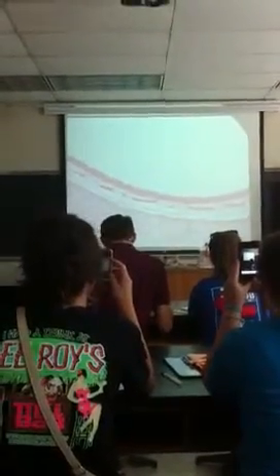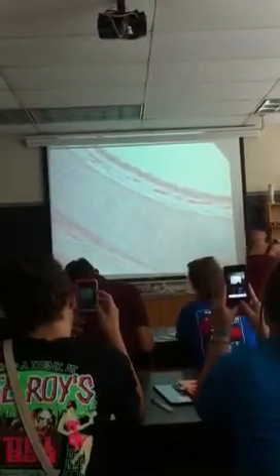our pseudostratified columnar. Now we go down one more, and we see this step right here, okay, which has these kind of dark colored little bits. Okay, and this is the hyaline cartilage. So this is what keeps your trachea rigid. You have this cartilage layer.